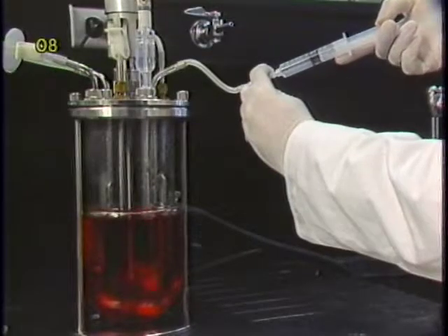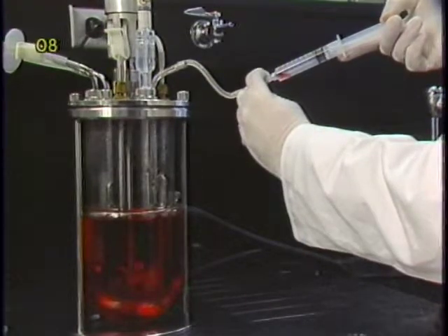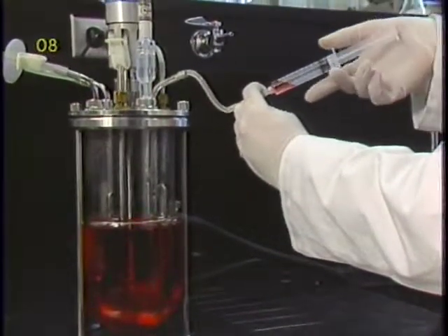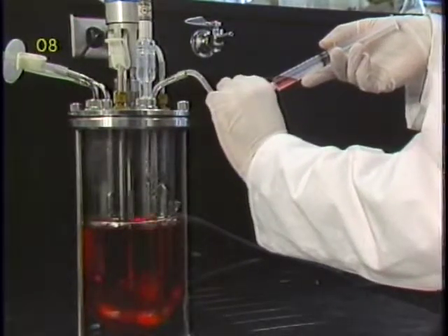When a fermenter is used, usually a sample is taken by withdrawing fluid from the sampling tube. A low flow rate is used when taking samples to avoid exerting excessive shear force on the cells in the sampling tube.